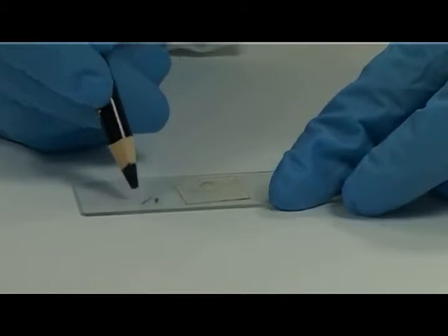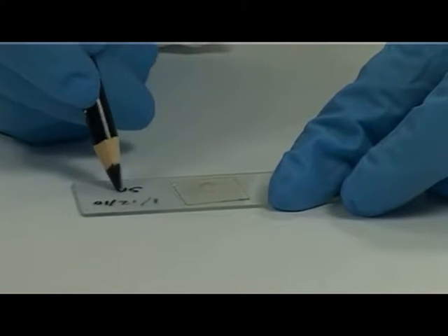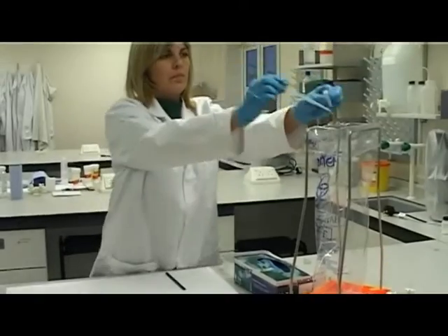Label the slide with the date and patient identification. Dispose of the used pipette, urine and used materials into the clinical waste bin.